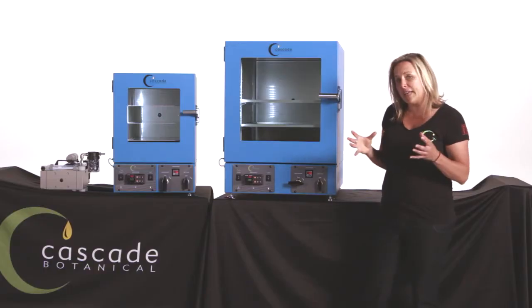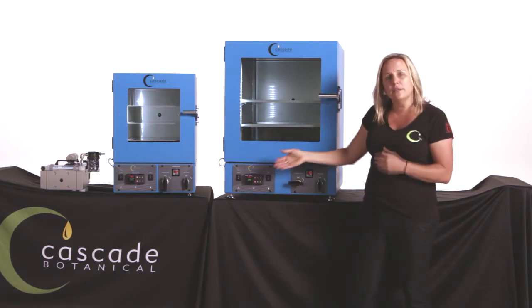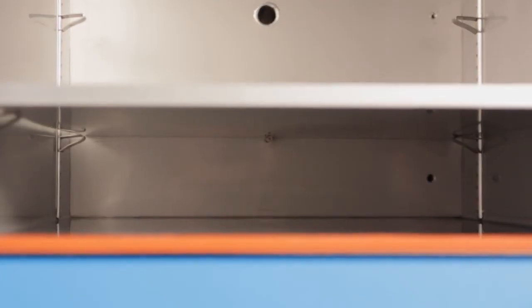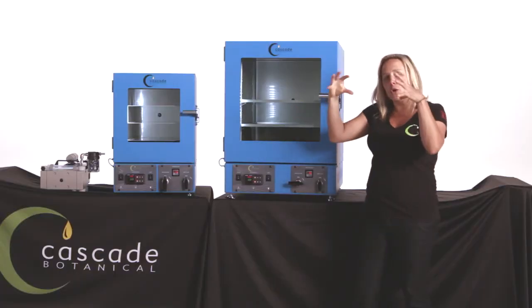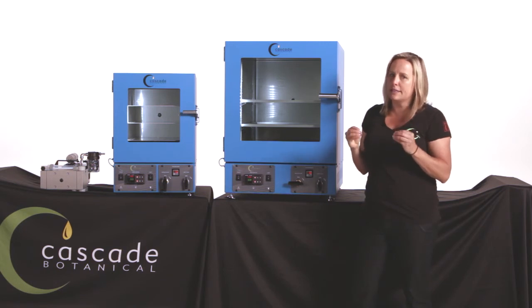What is still the same is that beautiful trifecta of a very, very powerful temperature controller, an intentionally placed, very visible temperature sensor smack in the middle of the oven, and those solid aluminum shelves. All three of those things work together to provide the best temperature uniformity in the industry.